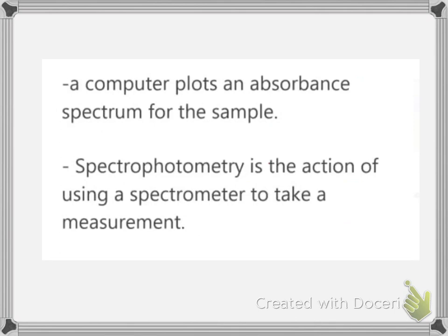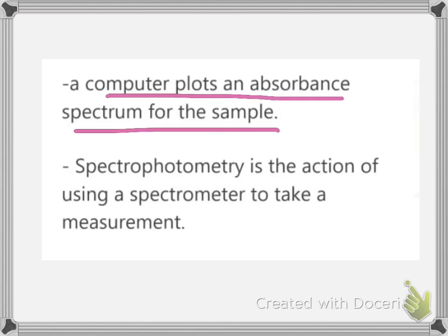It is a standard technique used in many chemistry laboratories. From the data collected, a computer can plot an absorbance spectrum for the sample.